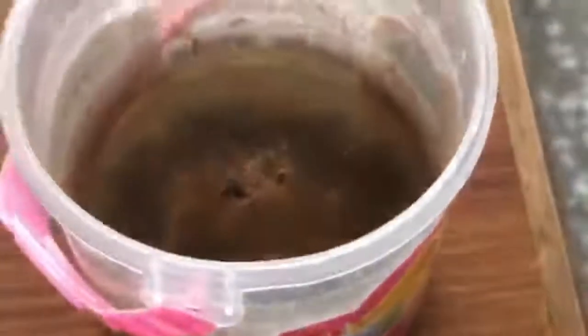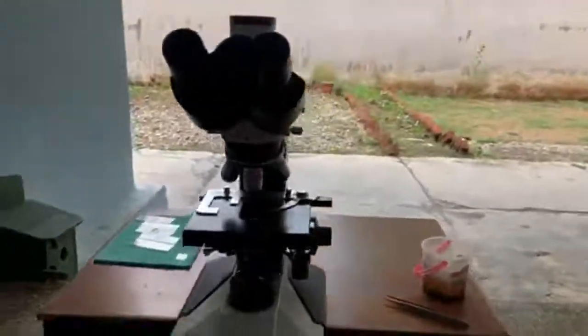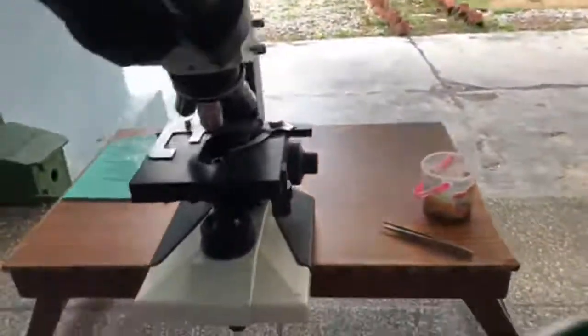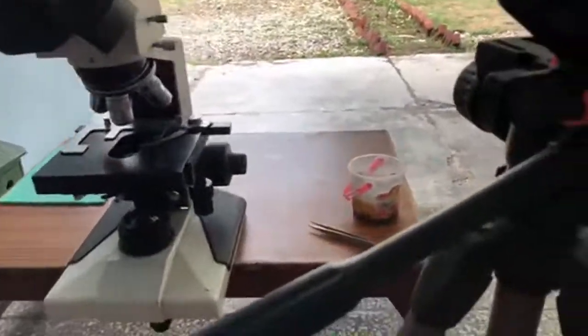So this part is what we are going to see, and we'll be focusing on this whitish thing and see if we can come up with something good. We won't be killing any organism, to the best of our ability. The setup will be quite simple. There is a tripod that I have here. I'll fix the tripod, and it will be aligned with the lens, and then the microscope would be put on. Let us see if we can get something good.